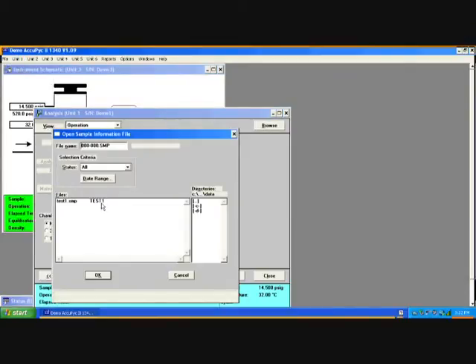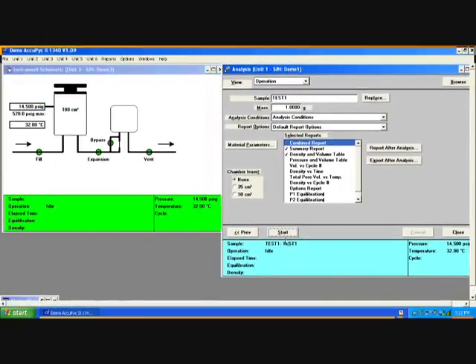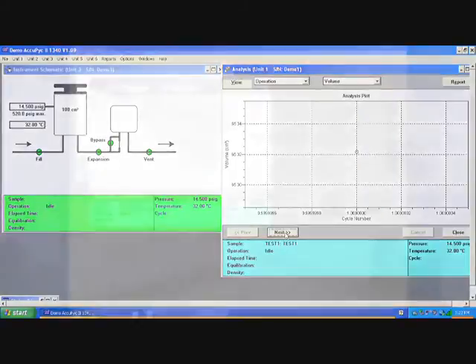From the screen we can monitor the analysis process. We chose only a single cycle, so at the end of that cycle, results will be displayed. Had we chosen additional cycles, they would continue automatically. Had we chosen run precision, at least 5 analyses would complete, and once we had 5 within the tolerance we set, results from those last 5 would be displayed along with average of the analyses.